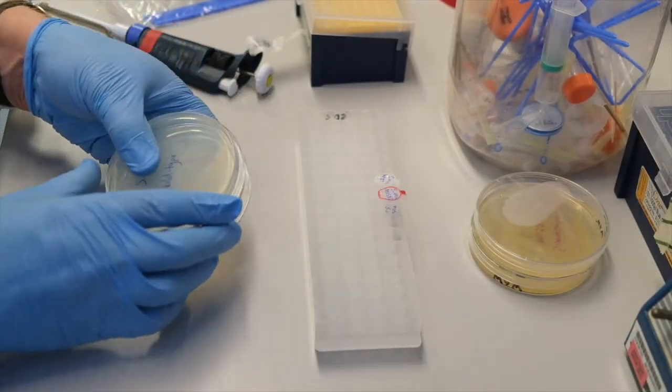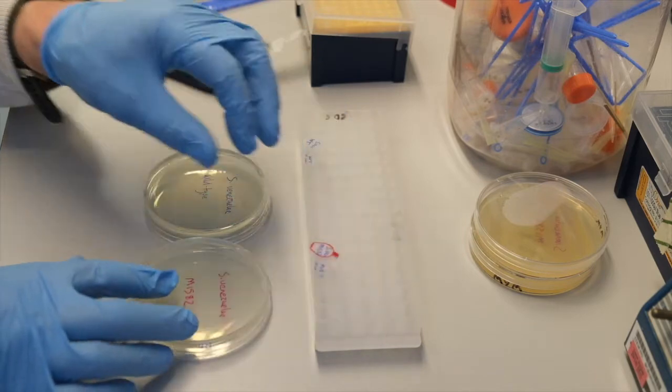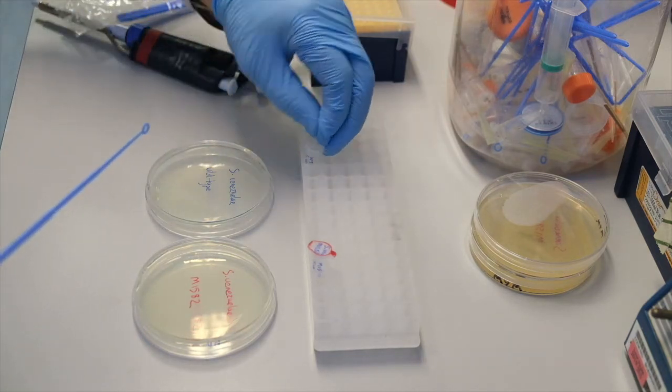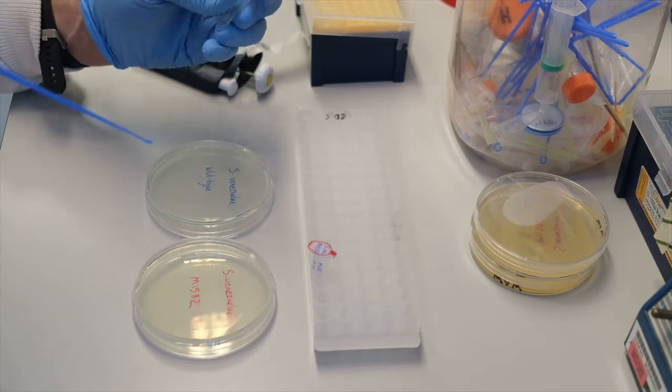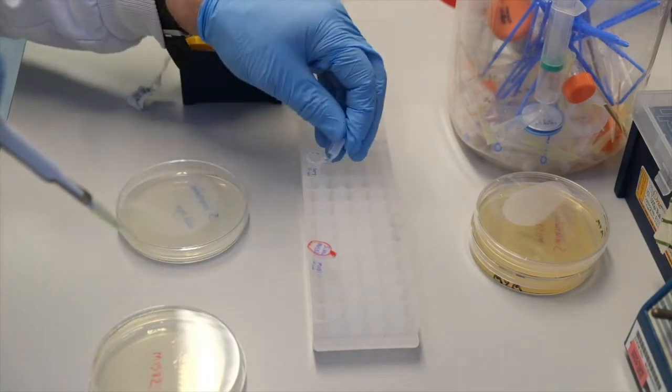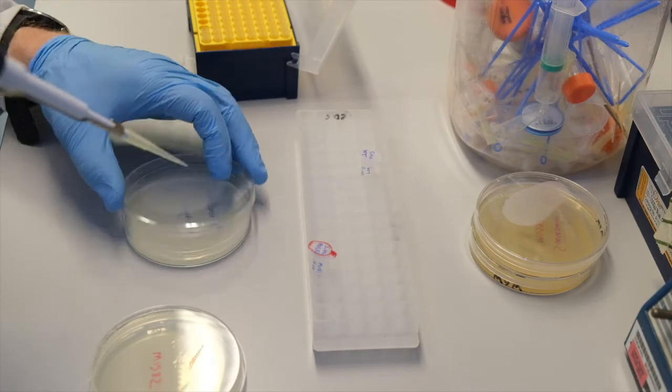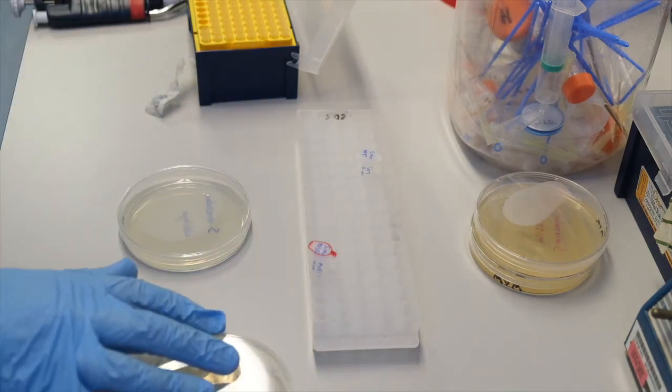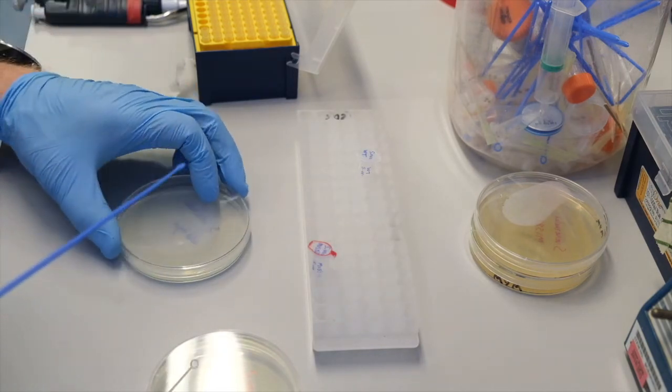Finally, we will streak out Streptomyces venezueli strains on nutrient agar plates. We could dip the loop directly into our spore stock, but unfortunately it doesn't fit into the bottom of the Eppendorf tube. Instead, we will pipette 5 microliters of spores directly onto the plate. This 5 microliters spot can then be streaked out with our first loop.